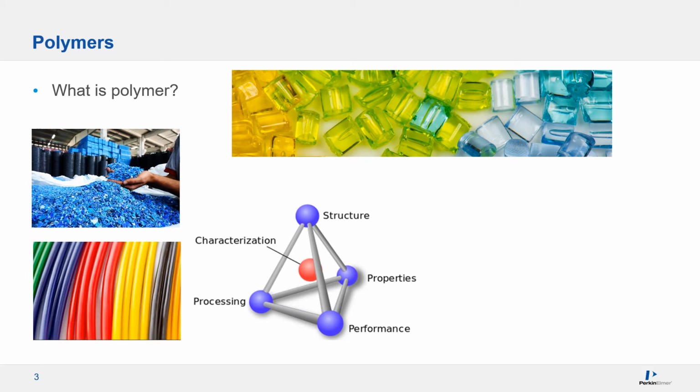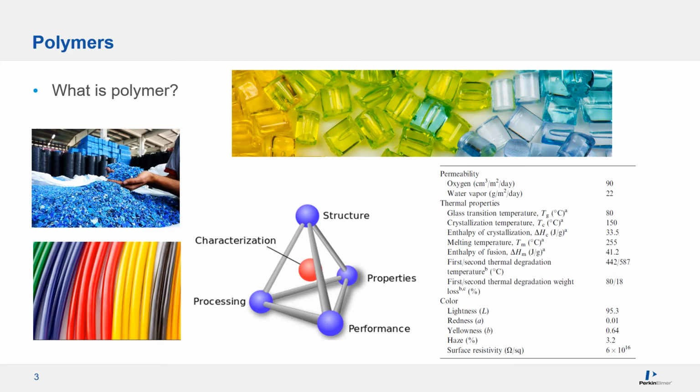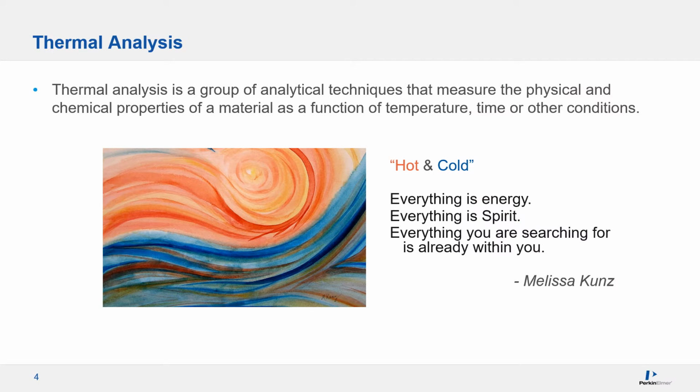From time to time, you may be looking at a material data sheet like this one and ask yourself, how do you measure these properties? Well, that's today's topic: how to characterize polymers using thermal analysis tools such as DSC and TGA. Let's have a quick overview of what thermal analysis is.